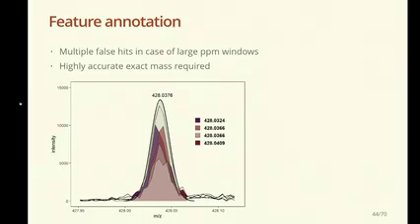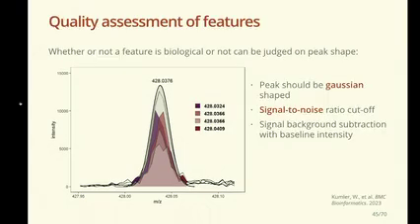And without going too much into depth, we've obtained quite good results in the feature annotation through adopting this approach, and even within small ppm windows of about 5 ppm, we can narrow it down to only a few options for a lot of the features that are present. But I'll dive a bit more in depth just a bit later. So we're still dealing a bit with the issue, and we'll never solve it as well: is a feature a true feature? Is it a noise feature?